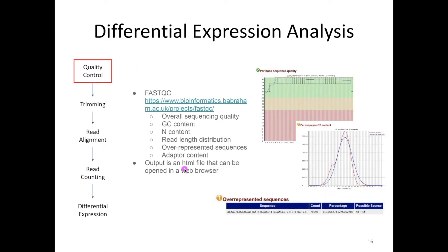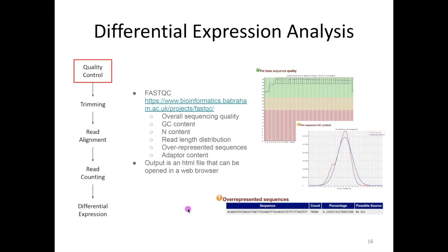You get millions — potentially hundreds of millions — of those rows back in your file, and we can't read them manually. So we need to do automated quality control using a piece of software called FastQC. FastQC reads your FASTQ files and gives you information about overall sequencing quality, GC content which can indicate contamination, how many N's there are, and whether there are any overrepresented sequences or adapters. You get back an HTML file you can open in any web browser. The most important output is the sequencing quality plot with green, yellow, and red zones.